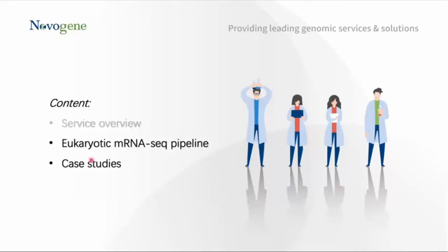Now let's move to the second part, and we will go through the eukaryotic messenger RNA-seq pipeline in detail, step by step.